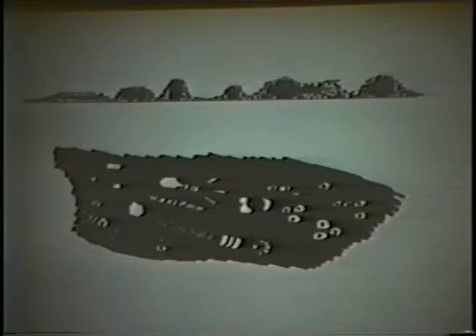The image that we see in the electron microscope is produced by the penetration of the electron beam through the biological material and the scattering of the electrons by the surrounding negative stain. Such images also occur in nature, for example, in calcified fossils. The next slide is of crinoids, or sea lilies. These are primitive segmented echinoderms.